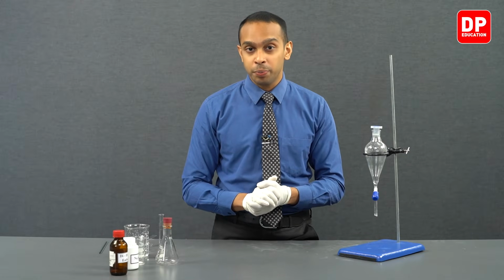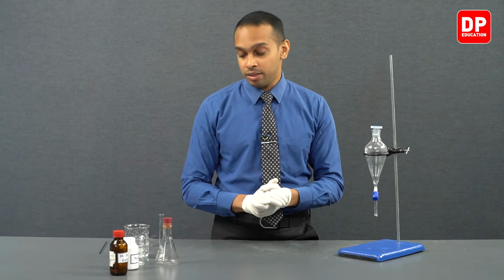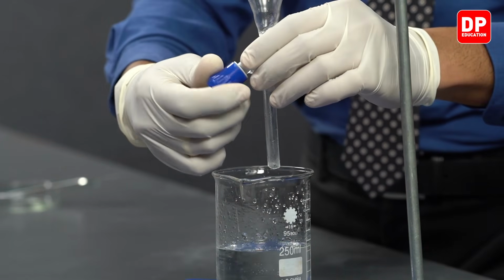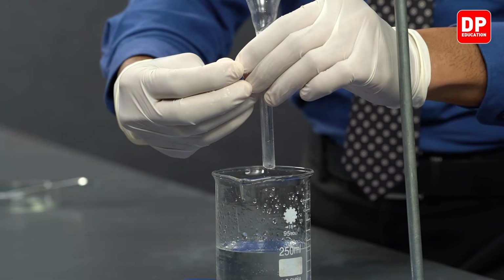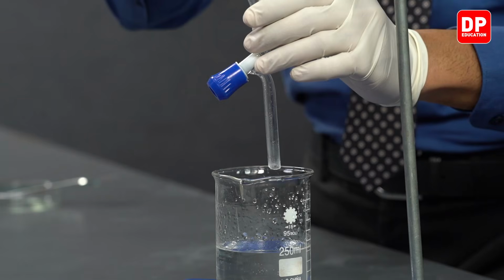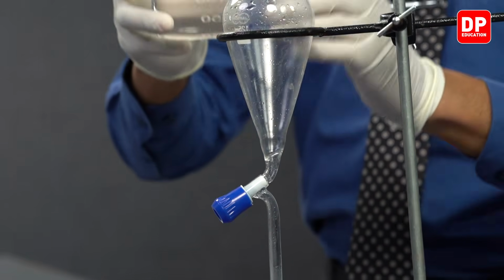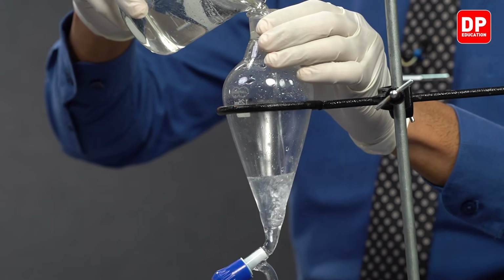and we will continue to repeat this process 2 more times with the use of diethyl ether. Now we will add the aqueous mixture again into our separating funnel. Before we do that, we can make sure that the stopcock is perfectly closed. After that, we can proceed to add this aqueous mixture into our separating funnel.